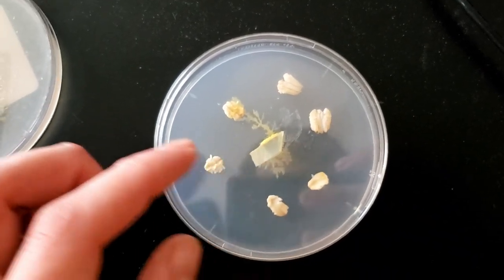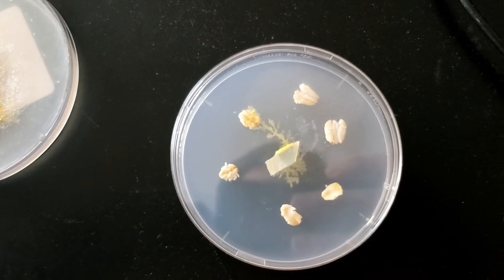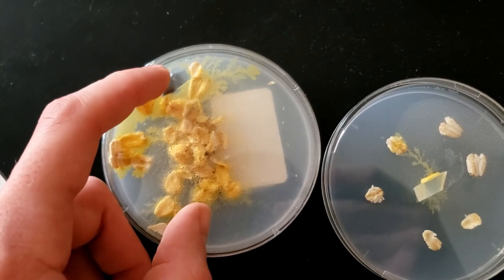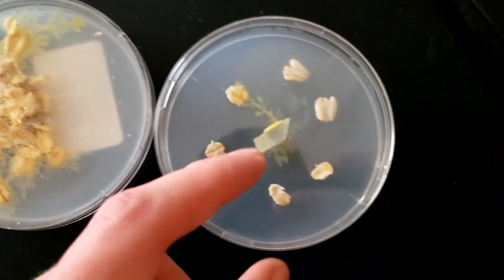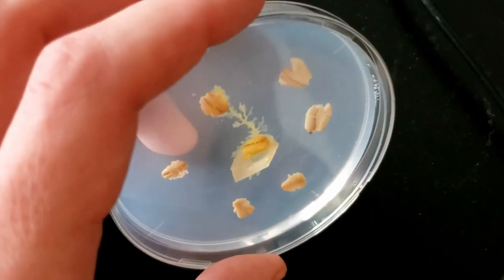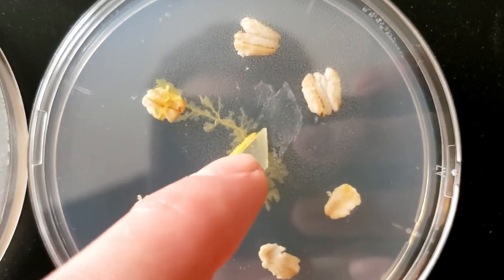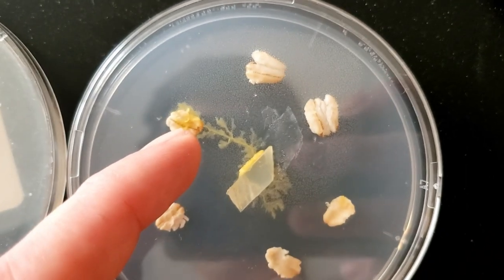This is after less than 24 hours of growth, probably more like 15 hours of growth. So what I did is I sterilized a scalpel, cut out a small section of the agar that contained the slime mold that was trying to escape, and then put the wedge on top on its side. So you can see it was on its side there. And put little bits of oatmeal all around it. And you can see it's already found a new snack. It's extended its little tentacle this way. It's found its snack and it's started to enjoy its meal.